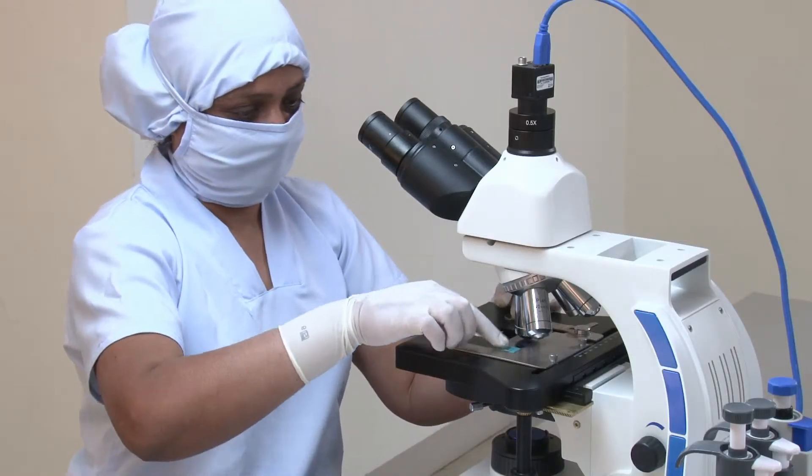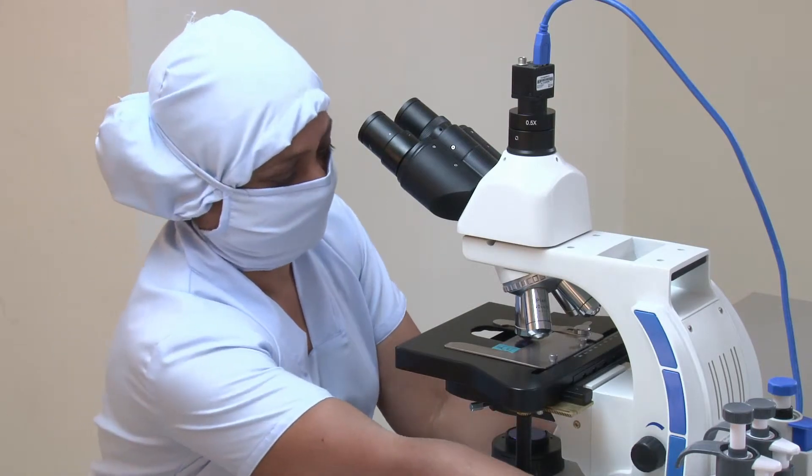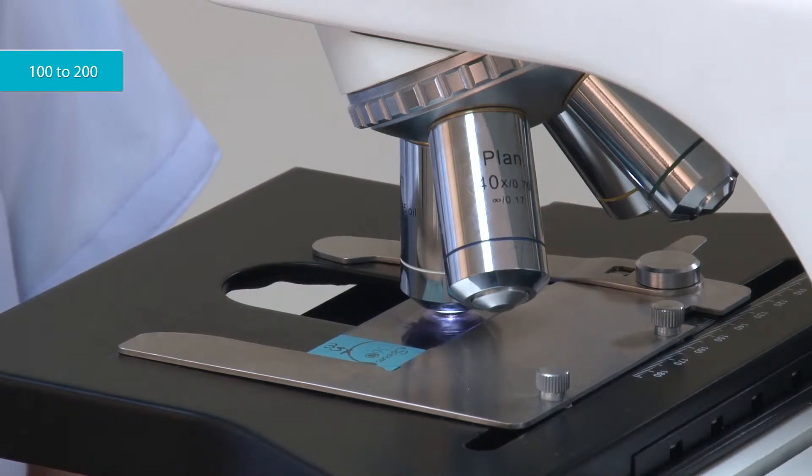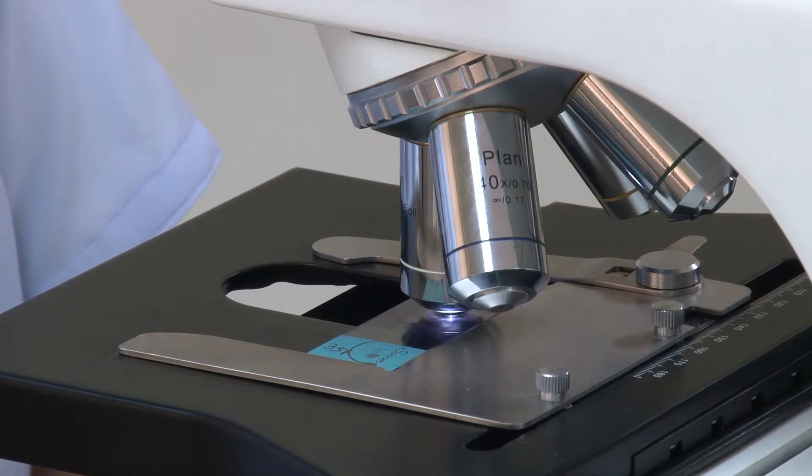Observe the smear under the microscope using 100X objective. Examine 100 to 200 sperm. Observe the sperm heads with blue and red stains.